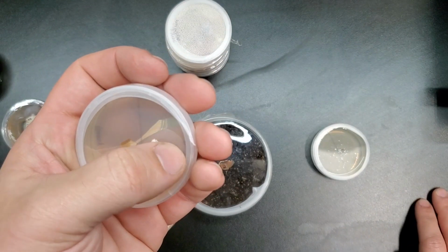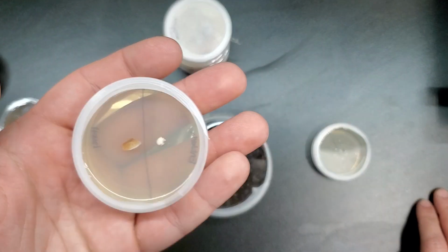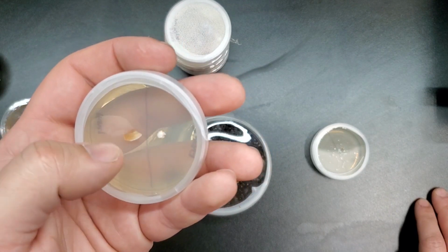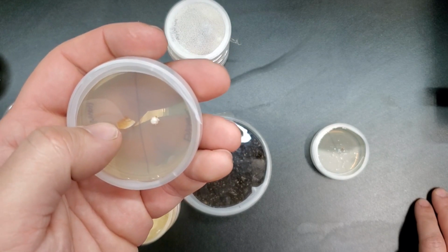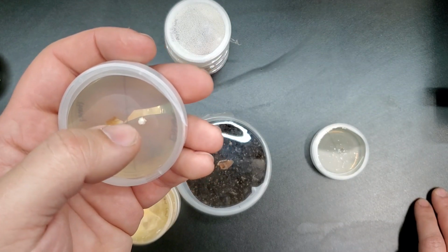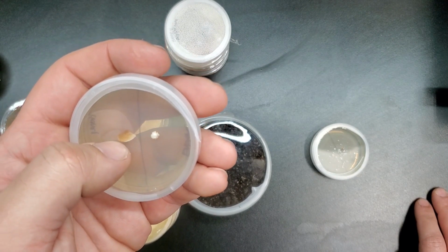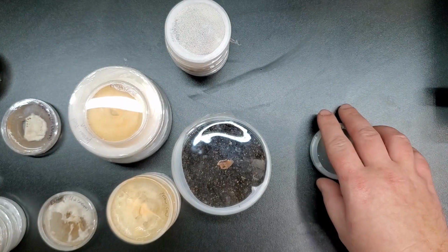Now that I say that, I'm still going to grow these out, the ones with the Entoloma and the honey mushrooms on the same plate. But I think maybe instead of putting them on at the same time, since the honey mushrooms grow so slowly compared to the Entoloma, maybe I will inoculate the honey mushroom side first, let that colonize for a while, and then I'll put some Entoloma on the other side. That way the Entoloma doesn't overtake the entire Petri dish before this has a chance to do anything. But I'm still curious to see what this does. So maybe I'll do that, maybe I won't.